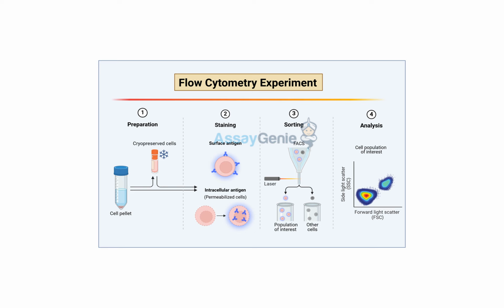And luckily, modern flow cytometry software has made this a lot easier. We can automate a lot of that process. That's great. But even so, understanding the principles behind compensation is still really important. It is, absolutely, so researchers know they're using the right settings for their experiment. Okay, so that's how we get antibodies into cells, make sure they're binding to the right targets, and even how we deal with potentially overlapping signals. But I know there's more to this story.